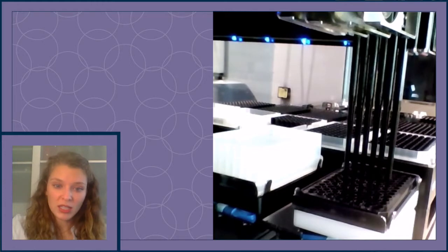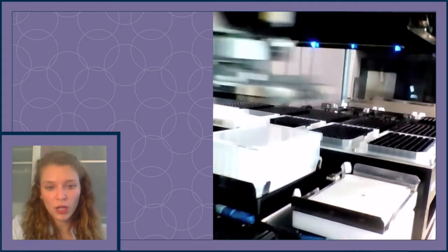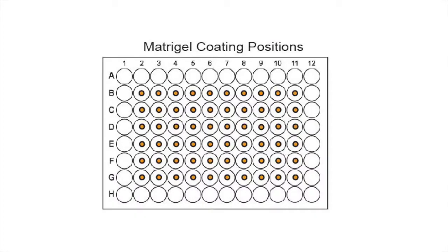The second method of this workflow is the coating of the 96-well plates. The 96-well glass bottom plates, stored in the Cytomat 6002, are brought to the CPAC cooled to 4°C. The plates are de-lidded, six tips are picked up, and they aspirate one milliliter each of diluted matrigel. This matrigel is then dispensed 100 microliters at a time per well to coat 60 wells of the 96-well plate. Tips are discarded, the plate is re-lidded, and returned to the Cytomat 6002. This process repeats for any number of 96-well plates.